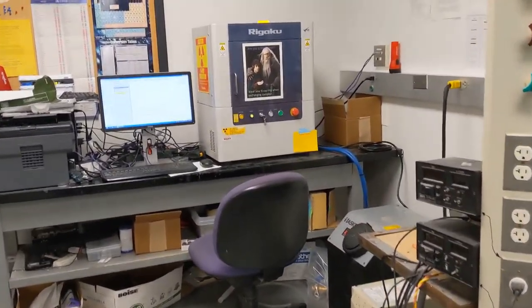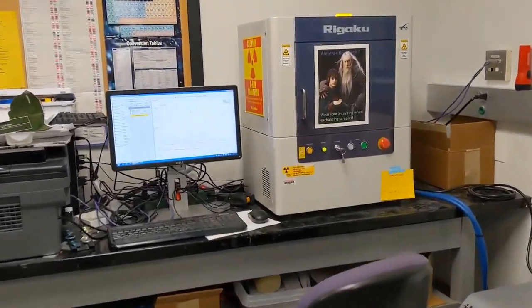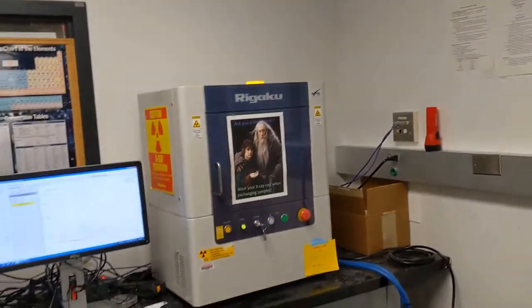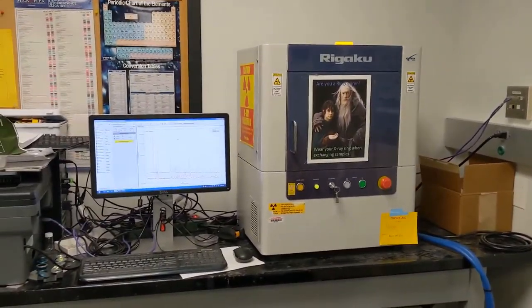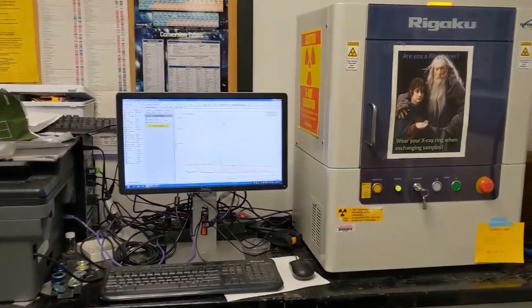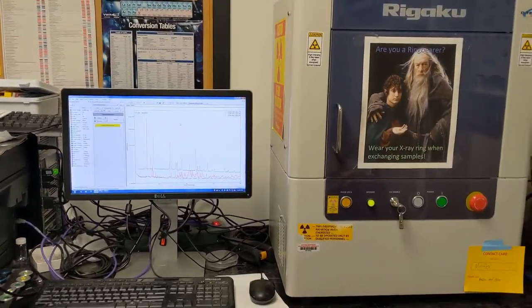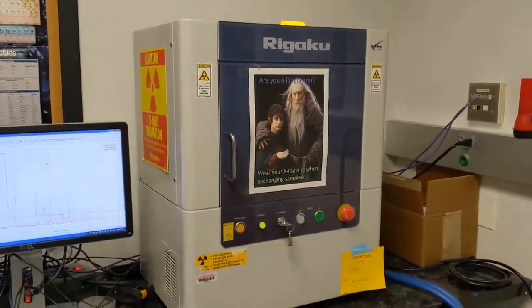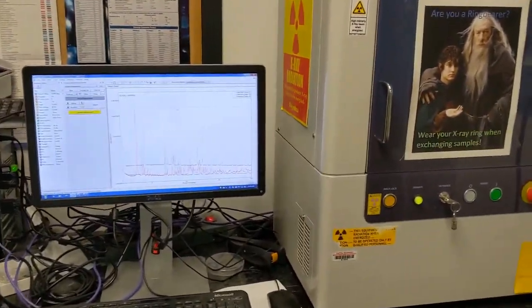If you're wondering why it's so loud down here, we have a second mini-flex in the downstairs lab. We have a chiller running to make sure our instrument stays cool and our x-rays stay safe. We have powder x-ray capabilities with two instruments and two single crystal instruments — we have all the instruments.